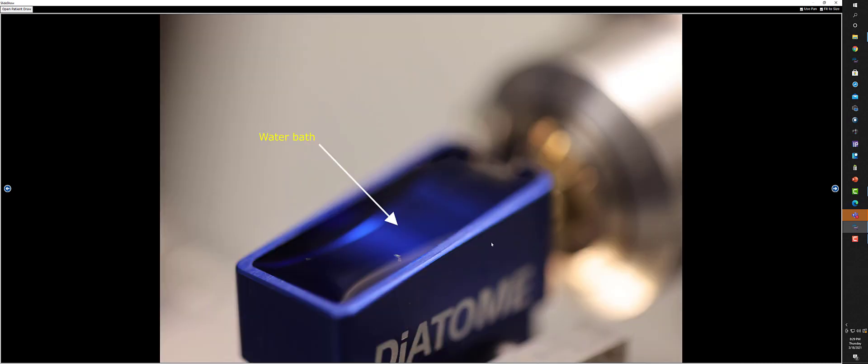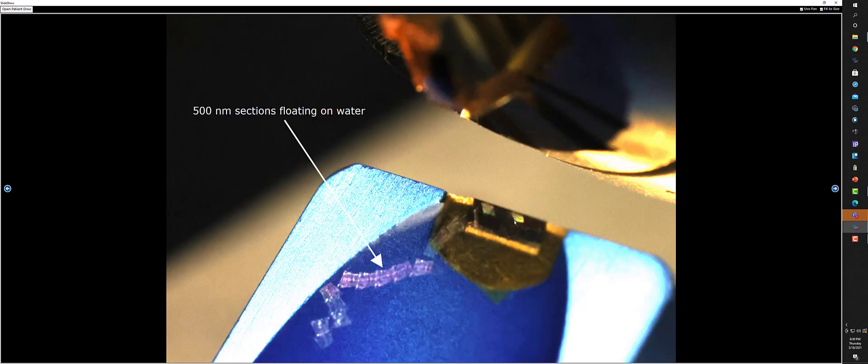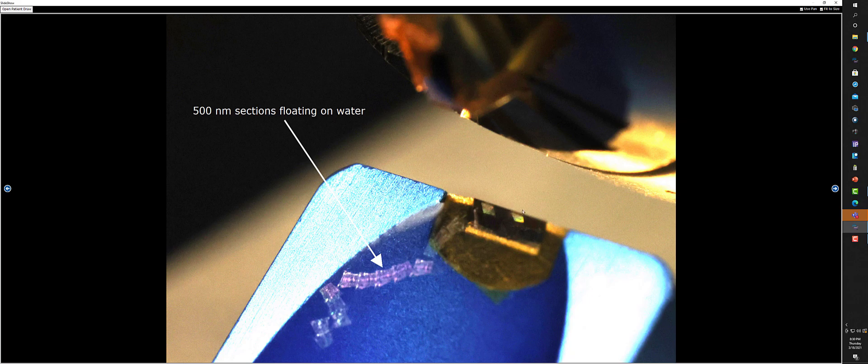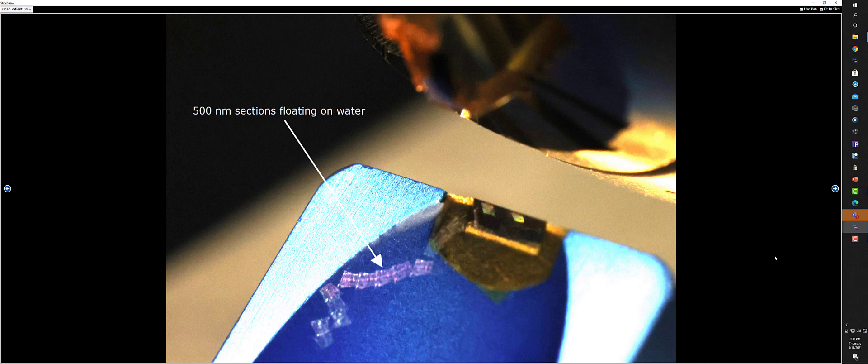You take your diamond knife and fill the trough here up with ultra-pure water. The sections, when they're cut by this knife, come off. Here you can see the pyramids, and you can tell the thickness of the sections by the interference colors. You have a graph that tells you what the different thicknesses are.